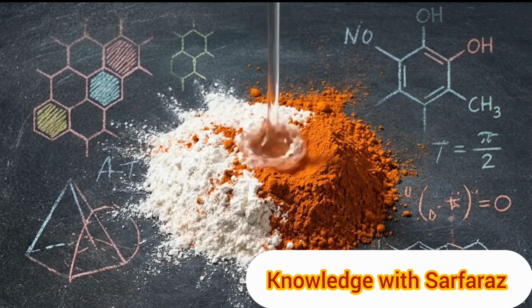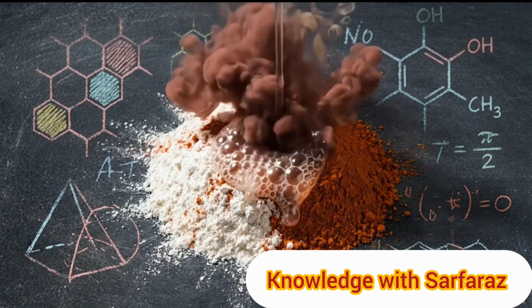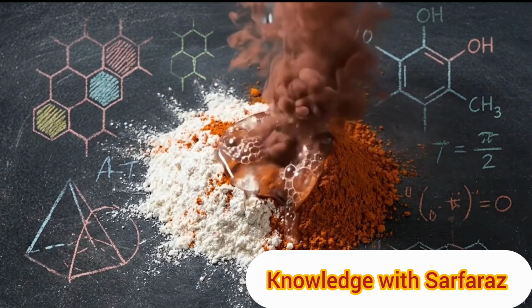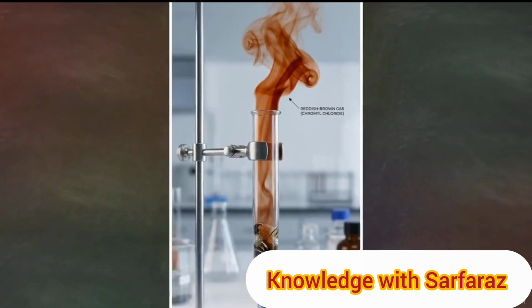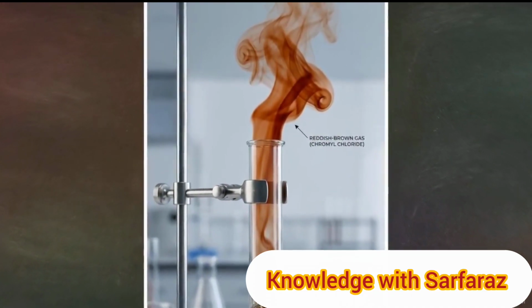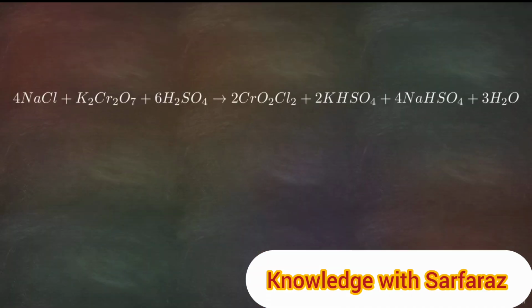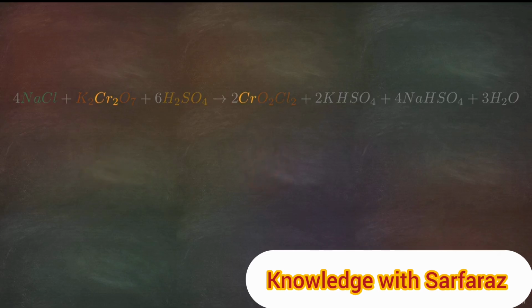By combining these reagents in a moisture-free environment, we create a highly acidic, strongly oxidizing matrix designed specifically to extract free chloride ions. When heat is applied to the bottom of the tube, the solid mixture transforms, volatilizing into the thick reddish-brown gas rising here. This equation details the transformation. Sodium chloride reacts with potassium dichromate and sulfuric acid to produce our red gas, Chromyl Chloride.